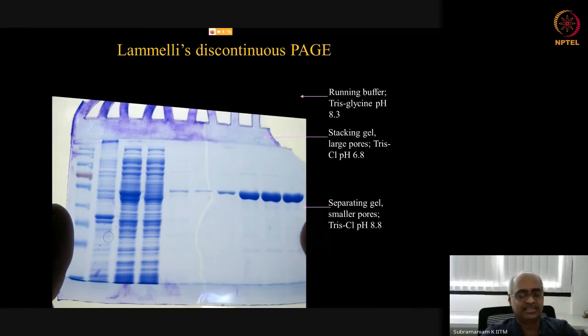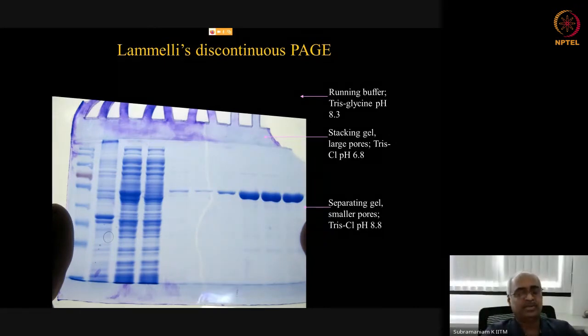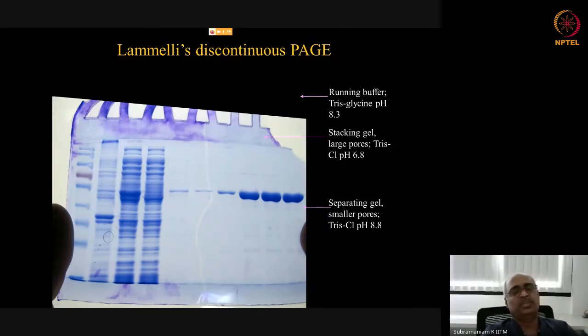It gets oxidized to acrylic acid. As a result, we pour this gel between two glass plates, and due to that, it is a thin sheet of gel, and we need to load sufficient volume of liquid. Here, sufficient volume, I mean in the range of 10 microliters to 50 microliters.